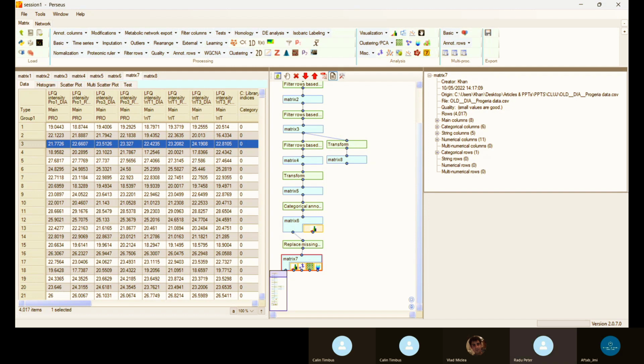And for next week, for protein interaction, will it be the same Perseus software? No, a different approach. We use different databases. We will go one by one through the databases and explain how to download the whole dataset from the internet and then how to filter the dataset for our use. Okay. For the next presentation I will optimize my PPT more, then I will share it from next week on protein interaction networks. Okay. Yes, very nice.